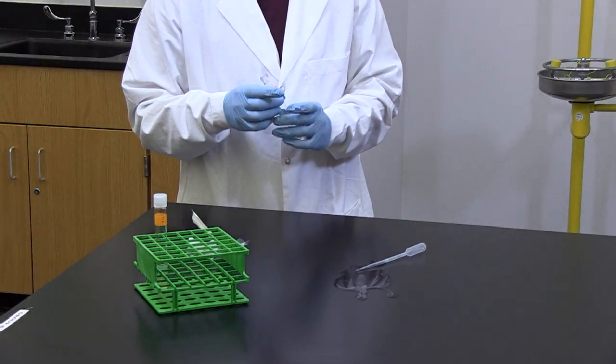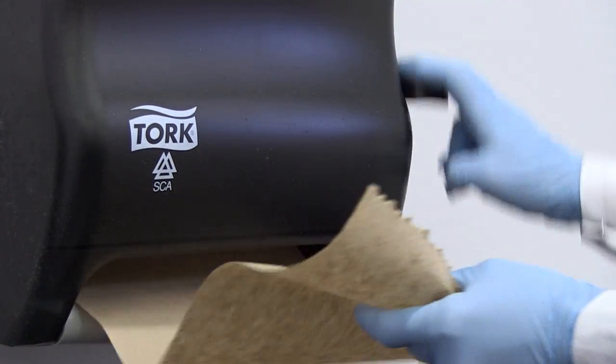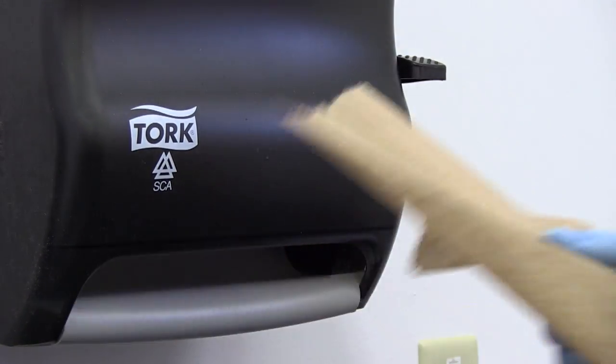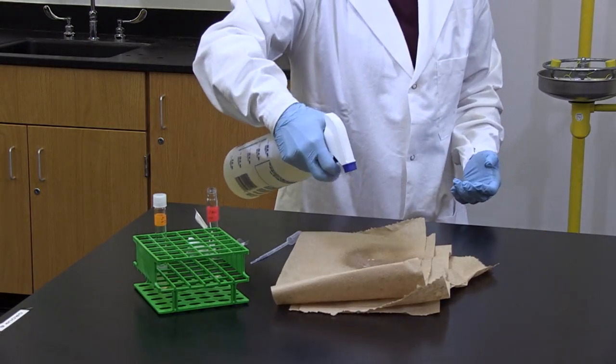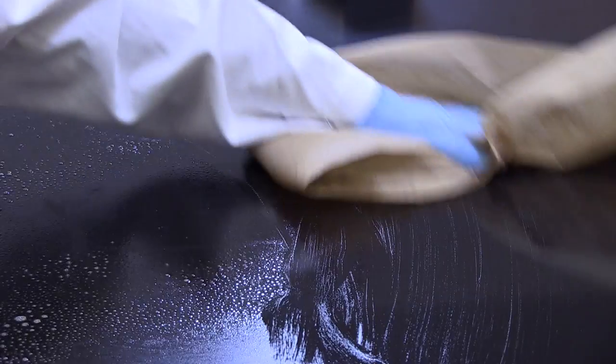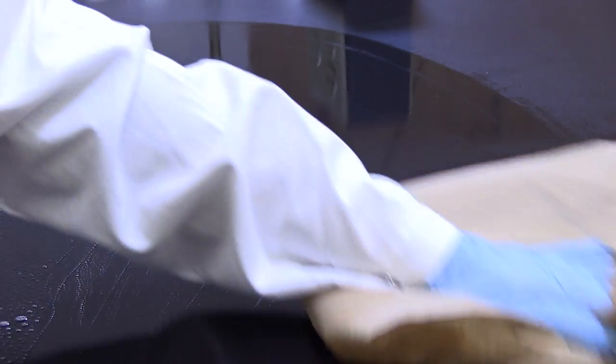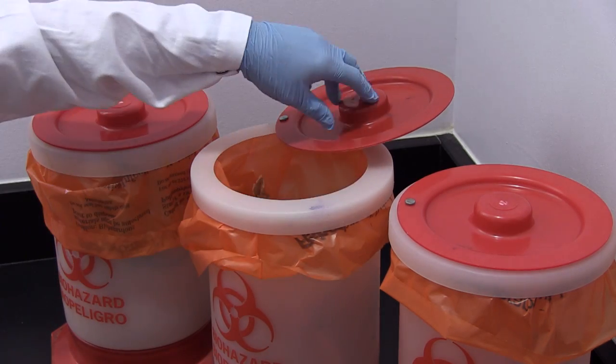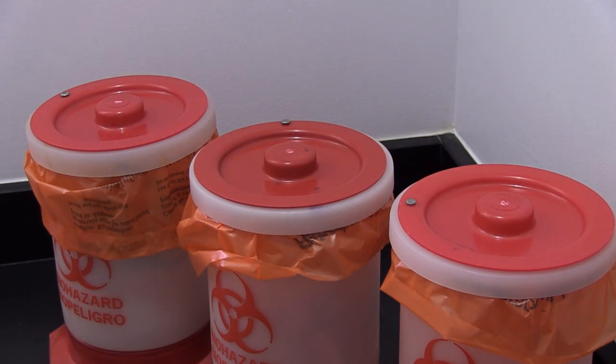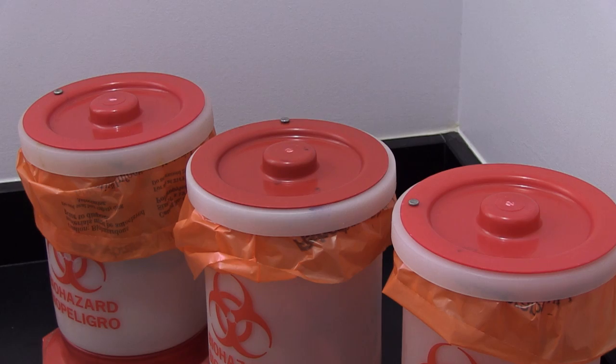Broken glass and bacterial cultures are a hazardous combination. With your instructor's approval, cover the spill with paper towels and saturate the towels with disinfectant. After 15 to 20 minutes, carefully wipe up the spill and discard the paper towels in the biohazard container for autoclaving. Discard the broken glass in the sharps container.